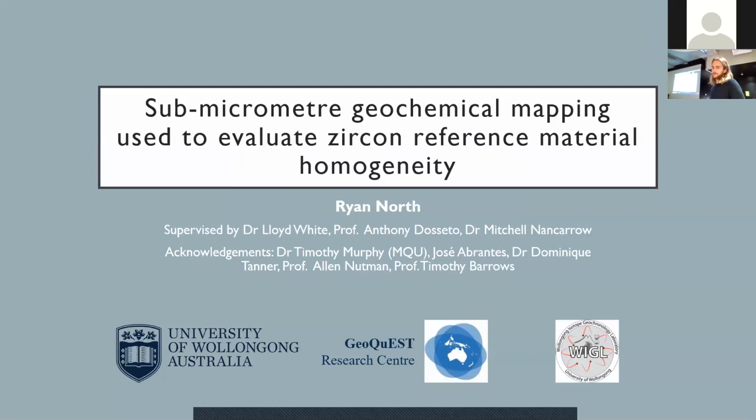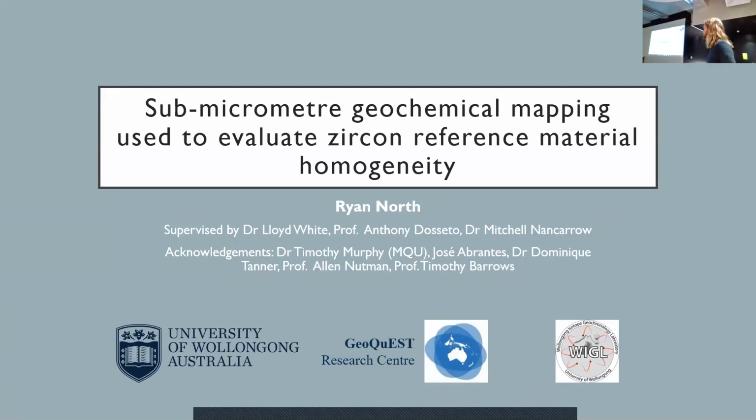So this was a GeoQuEST funded project. That was basically to establish uranium-lead dating here at UOW for zircon crystals. And secondly, to develop this new technique called TOF-SIMS, which I'll introduce soon.